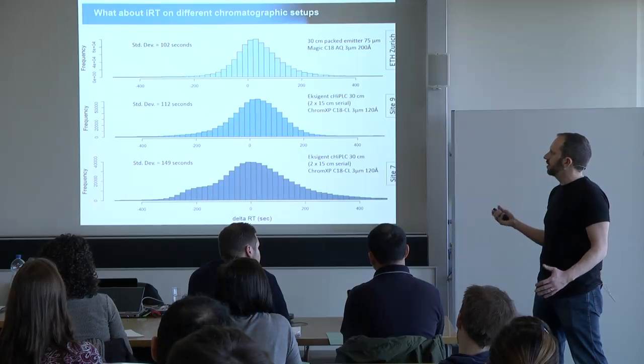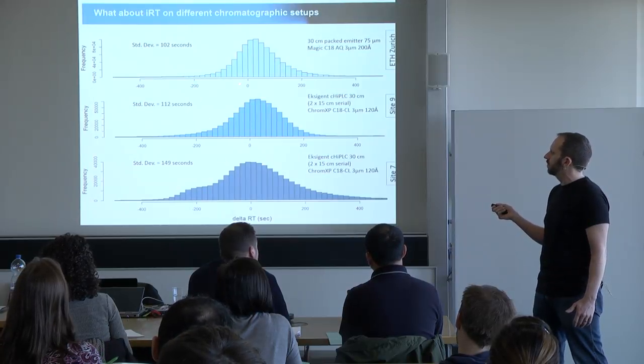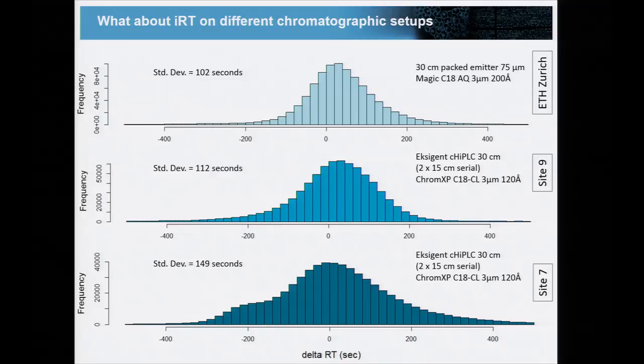So the point here is that this IRT concept, which we tried to tell you allows you to transfer assays across labs, works to a degree. It works reasonably well. The errors are not that much bigger when you go to a different setup.